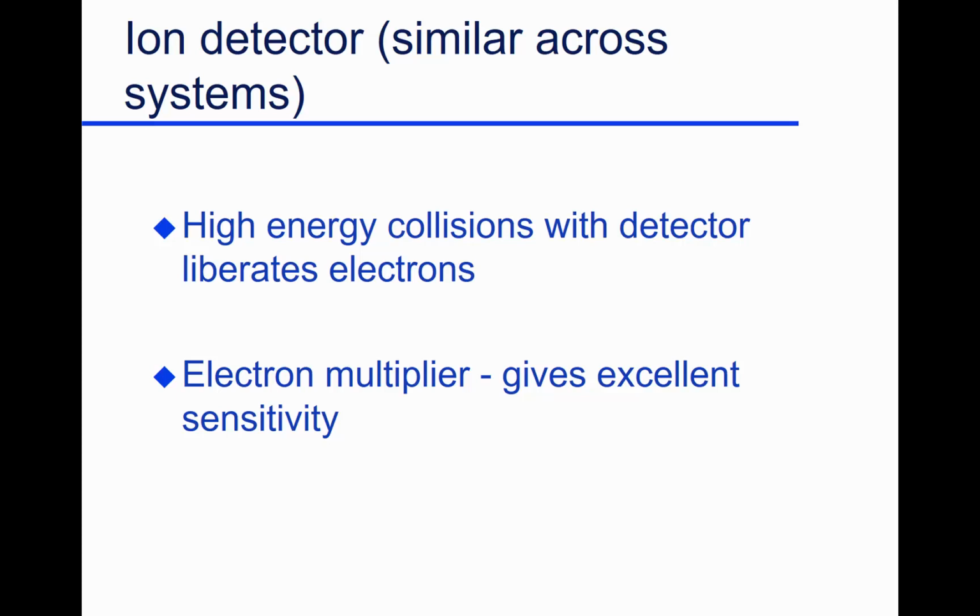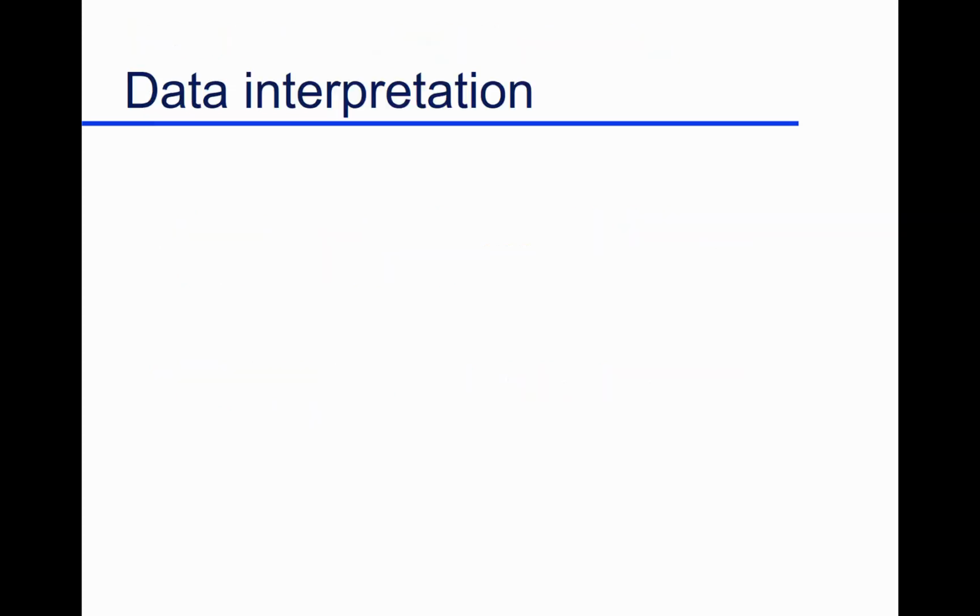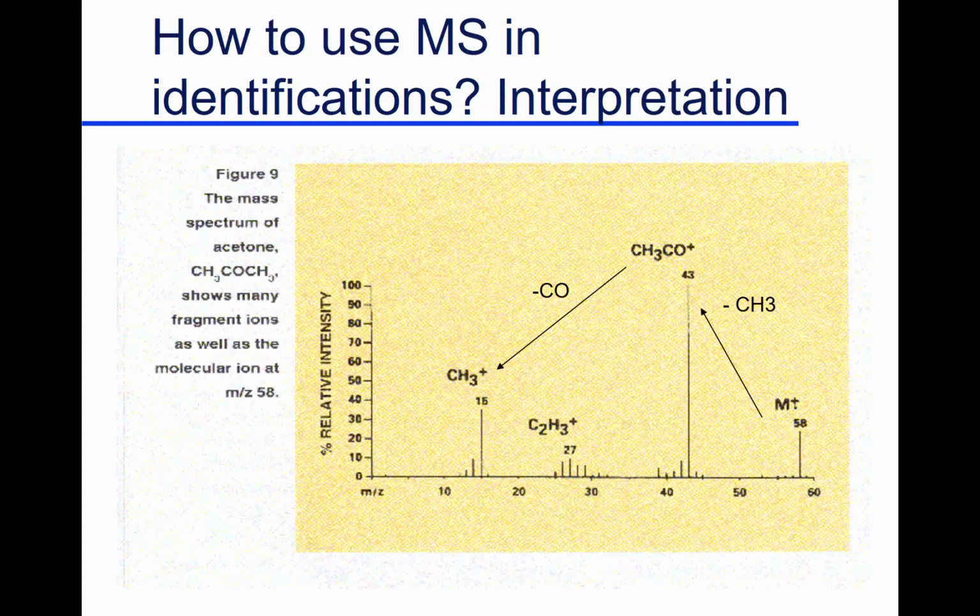In our other methods, for gas chromatography, liquid chromatography, there's no multiplication. You see what you get. If there's a compound coming through, it burns, that's what you got. You can't multiply it. But this system, working with ions, you can multiply the ions and the charge. So it's an extremely popular, extremely beneficial type of detector.